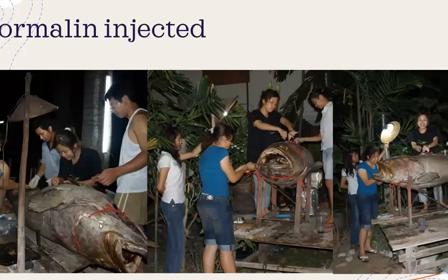And after we put all the things inside the body of the fish, you can make exactly some plates, and you can be 100% sure of fixing them. And after that, how to make it look thin, like a fish still alive, and also the fins, the pectoral fin, the pelvic fin, and every fin, and how to fix them.